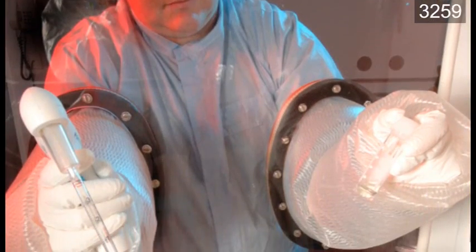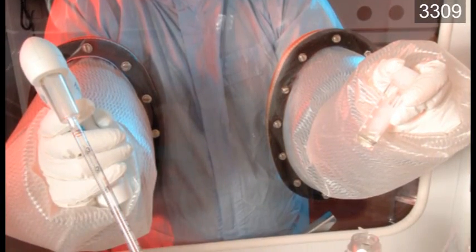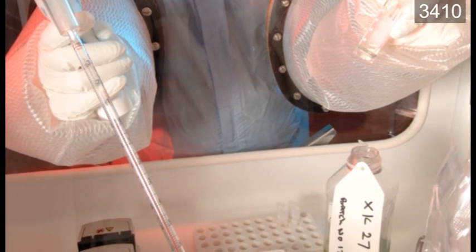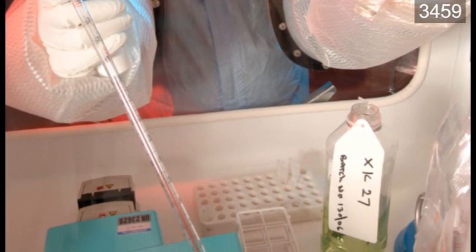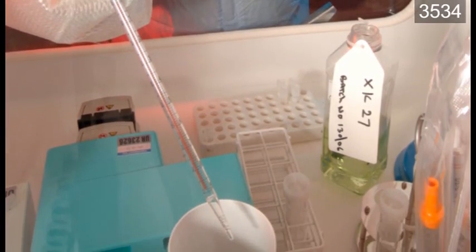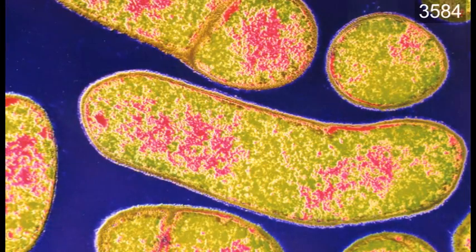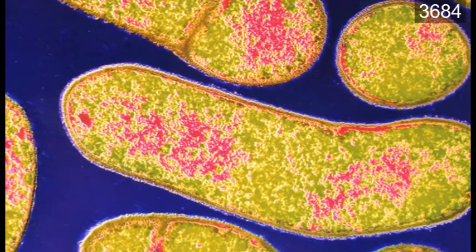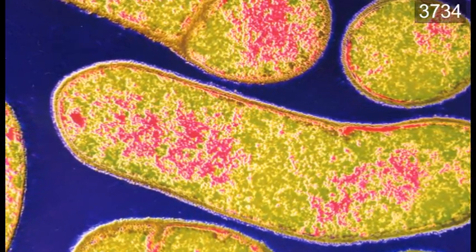In addition to being able to offer a fairly routine fermentation, for example E. coli, we're also able to handle organisms at high levels of containment. For example, Clostridium botulinum, we would handle as an ACDP3 organism, which effectively means every part of the process is contained and cannot escape to the environment.